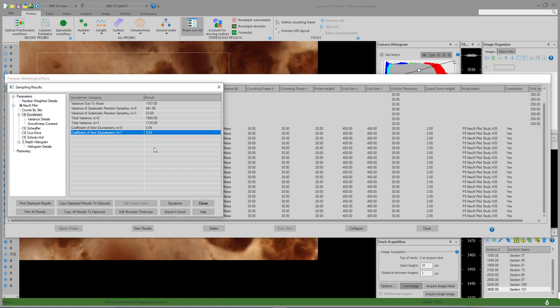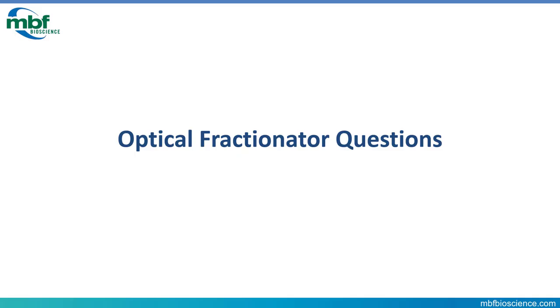The second most important number is the Coefficient of Error. Stereo Investigator lists several of these; the most commonly used for biological work is the CE Gundersen M equals 1 value. Remember that the Coefficient of Error is the distance away from the target that you are — a number that's only given to you by stereology, not by any other approach to counting cells. And there's an easy Export to Excel button that will create a spreadsheet with all of your information in it.